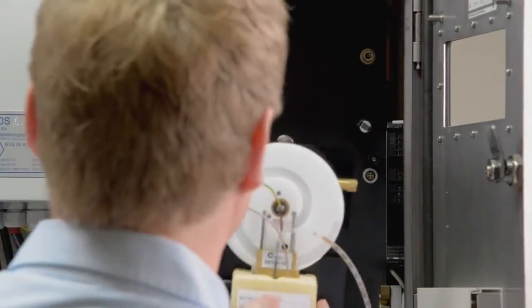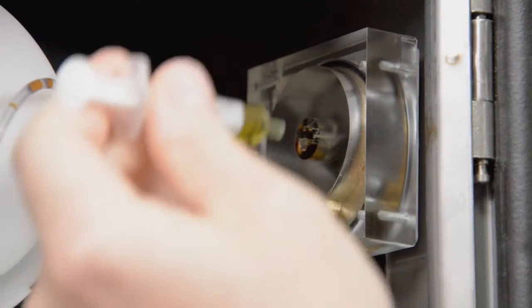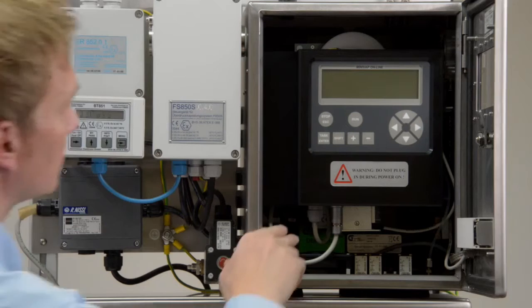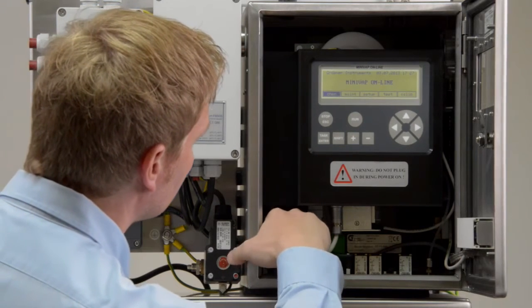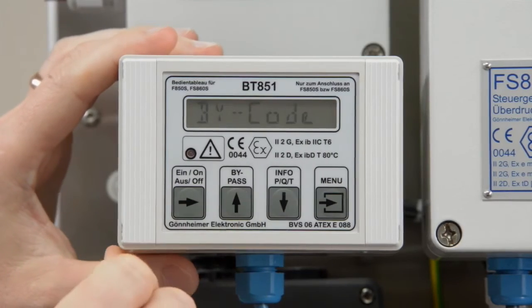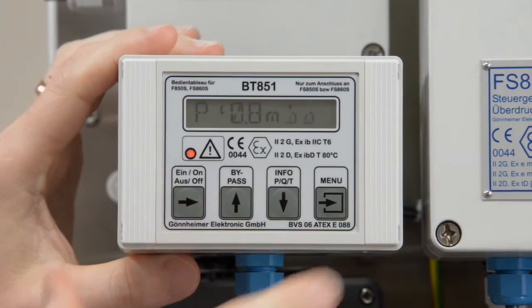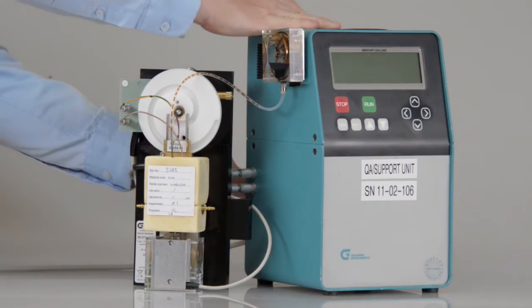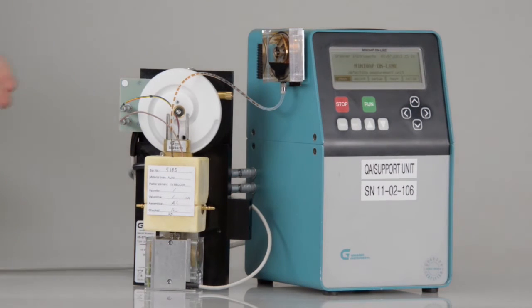Attach the new cell. Refill oil if required. Press the On/Off button on the mounting plate, then activate the purge control. Then press Run to start the measuring cycle. For calibration, the measuring cell is easily attached to a service unit.